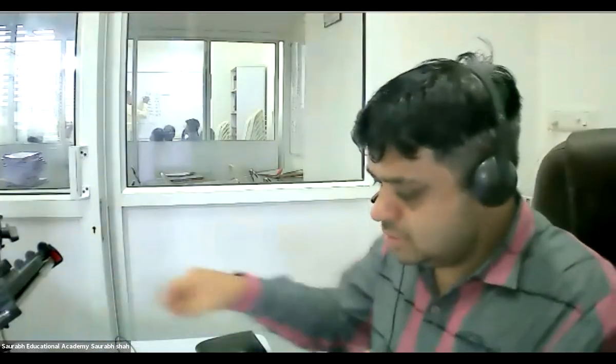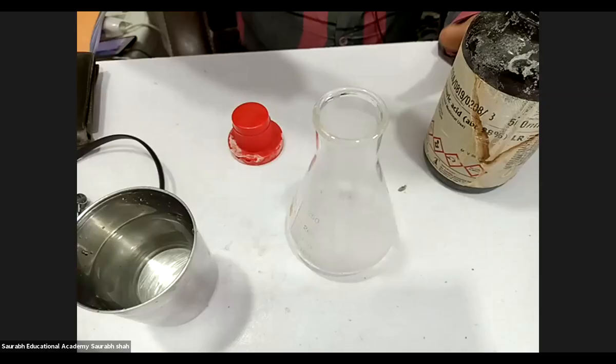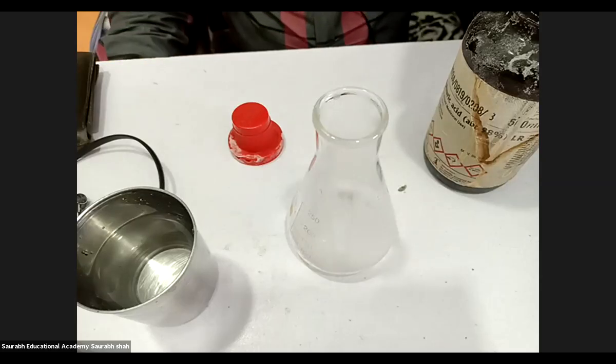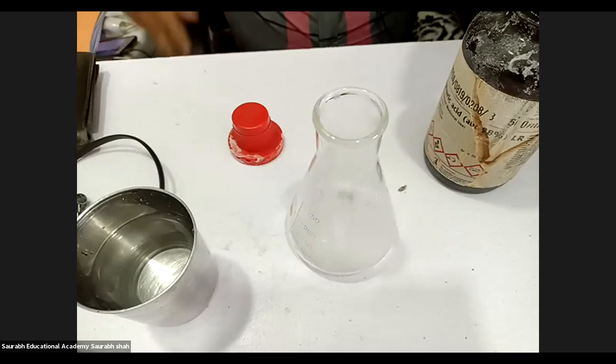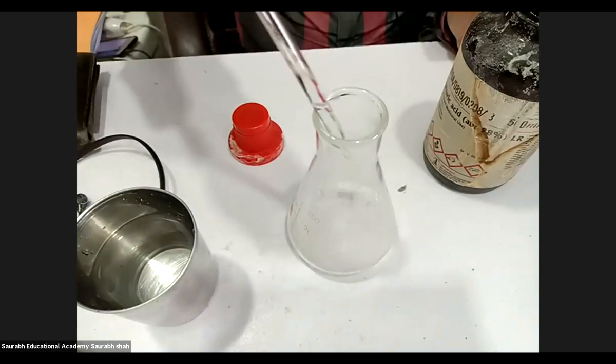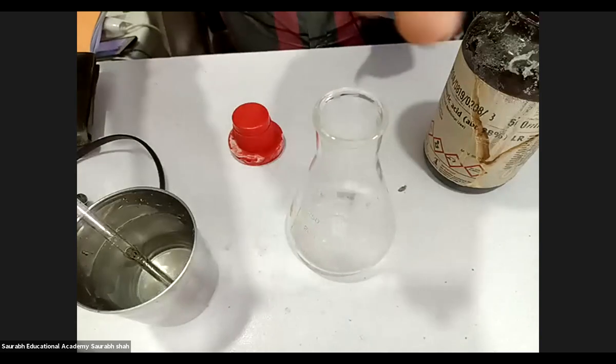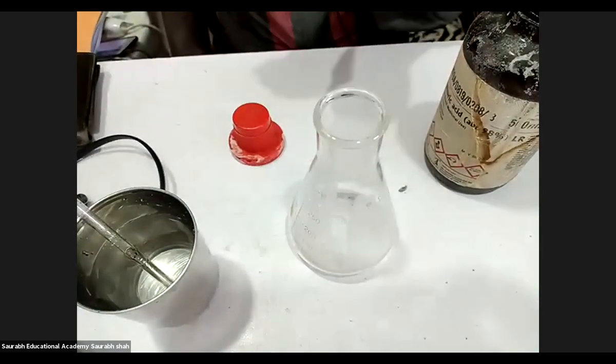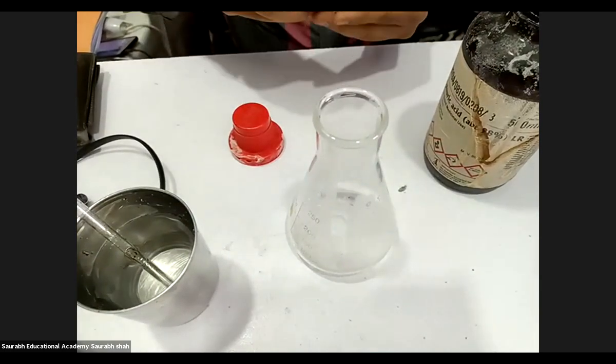Now we are adding some zinc granules to it. Sir, press the mic button once. Yes, sir, it's coming double. Okay. Now see, these are the zinc granules, right? Zinc metal. I am adding.